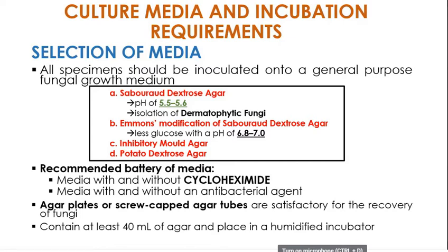Ang advantage niya kasi is that, since screw cap siya, and then konti lang yung media niya doon, mas lessened ang dehydration. Nakikip yung moisture. Whereas kung plate ang hawak nyo, you were able to experience naman holding a plate, opening a plate, it's much easier to manipulate. The only thing there kasi nga is yung evaporation din ng dehydration ng media.